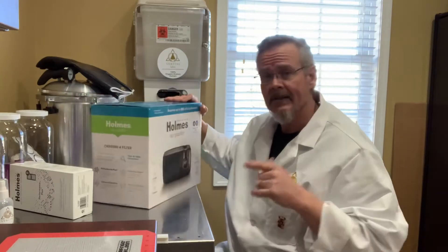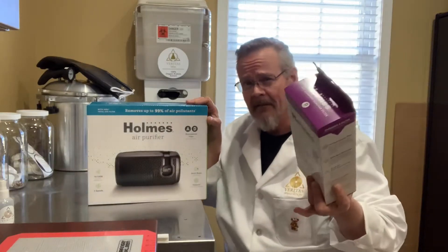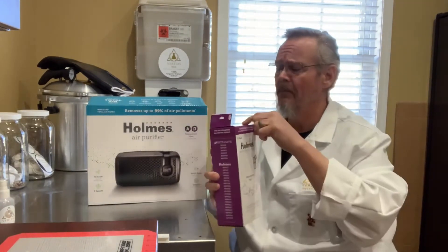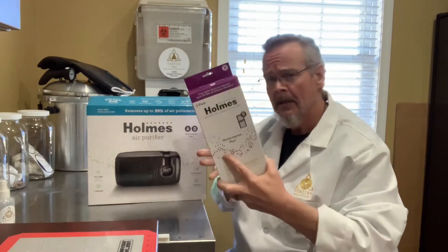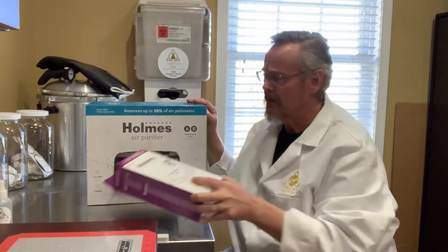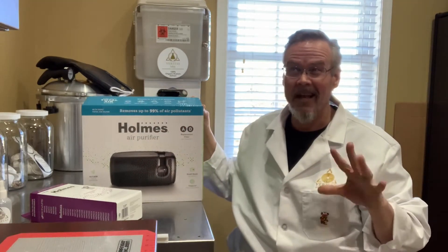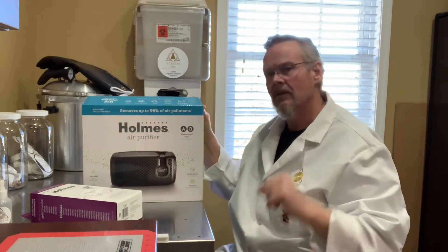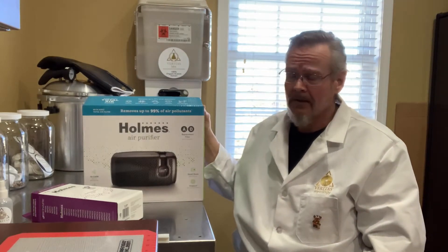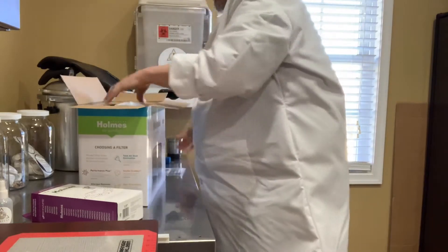So this is what it is. I got this at Target, right at $36 or $37. There's a two-pack of filters that you'll need. They are the D filter, and it is purple, which indicates that it's HEPA — it will say on there 'true HEPA filtration.' A two-pack of those is also like $36. So you get two packs of filters and the unit itself for about $75. You'll also need a roll of duct tape and a couple of dry cleaning bags, so count on that costing you right at $80.